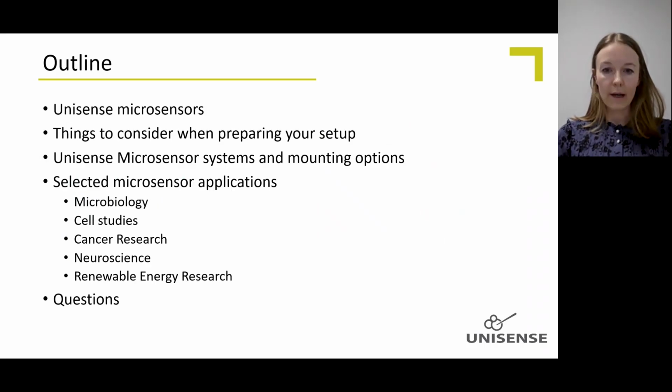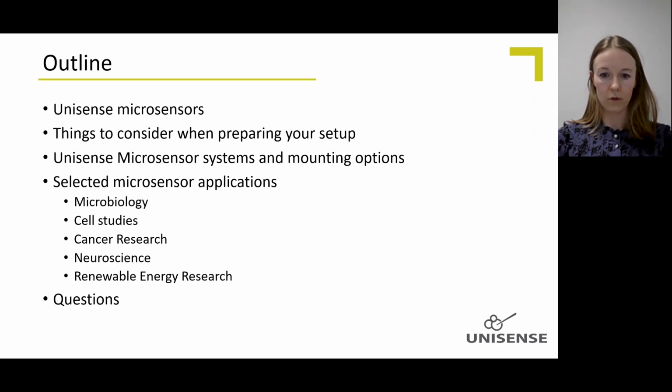Yeah, this is the outline for today. First, I will briefly introduce you to the Unisense microsensors and explain why microsensors can be a nice tool for analyzing biological samples. Then I will go through some of the things you should consider when you are preparing your microsensor setup. And this will be followed by an overview of the different microsensor systems. Then we will explore some examples of microsensor applications within microbiology, cell studies, cancer research, neuroscience, and also renewable energy research. And at the end, we will have time for your questions.